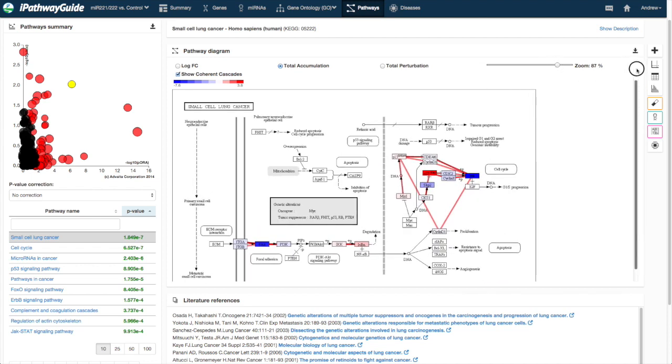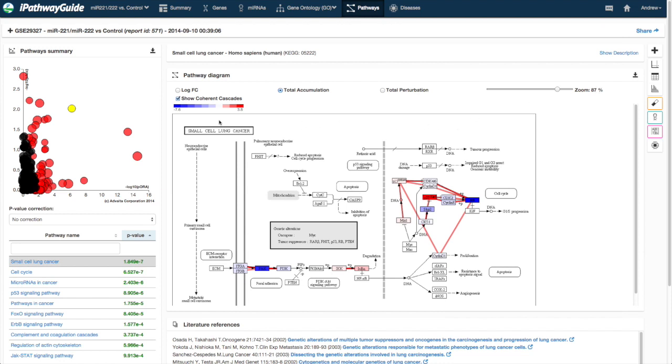To display the accumulated perturbation, choose the total accumulation radio button above the pathway.